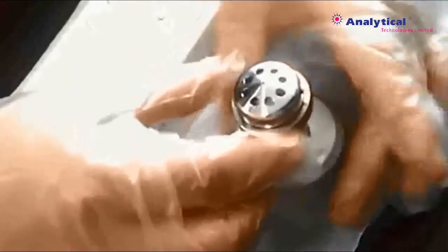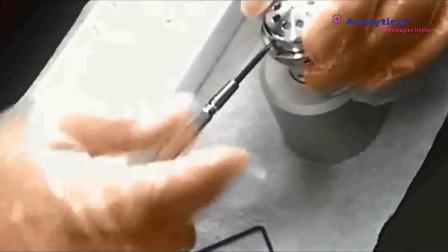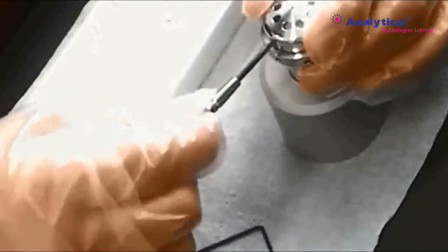Make sure that the tip is at the center. Then, tighten the top of the cylinder to the end. After tightening, unwind it 2 times. After unwinding it 2 times, tighten the screw at the top of the cylinder by using the flat head driver.